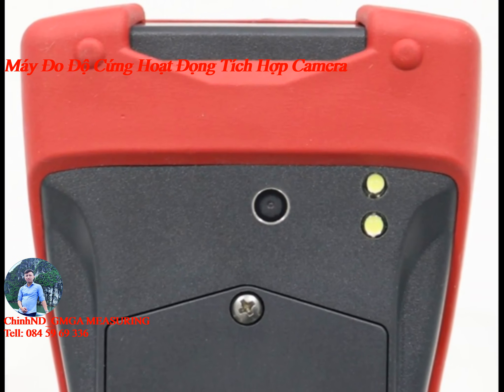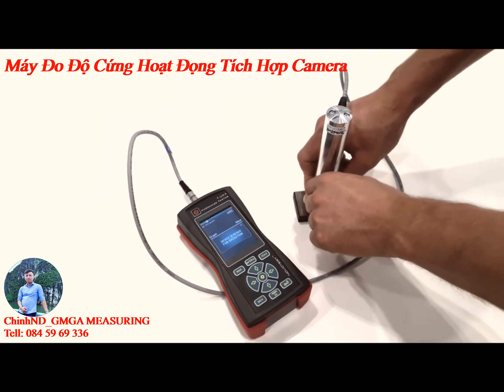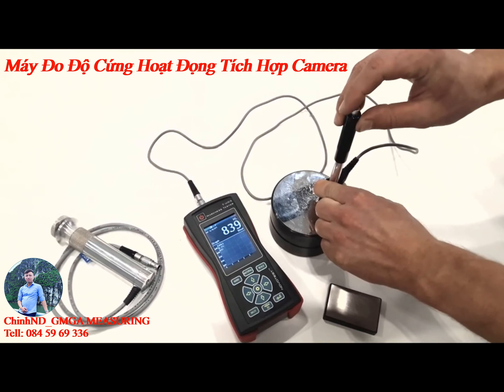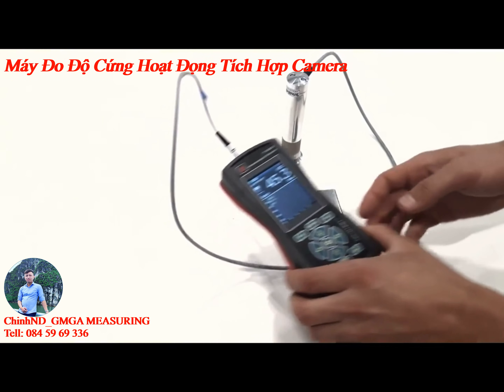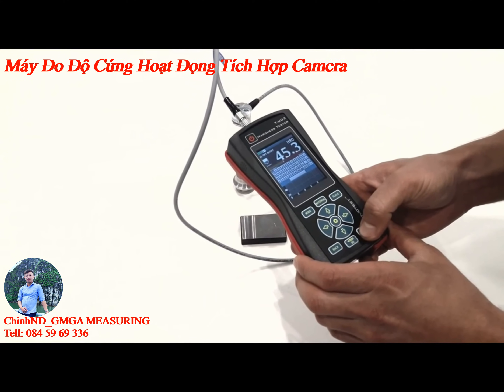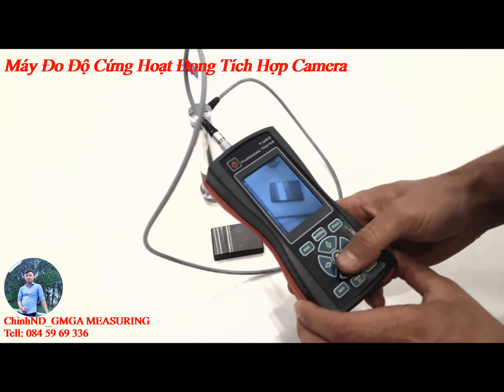Just look how simple it is. First, do your measurements. As soon as you close your measurement session, the device will automatically go to photo mode.